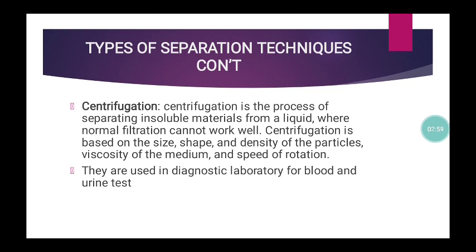You will discover that the denser one, which is usually the aqueous one, will be at the lower end, and the lighter one will be at the upper end. So during the separation, you just open the funnel, and the denser component of the mixture will come out before the lighter one.